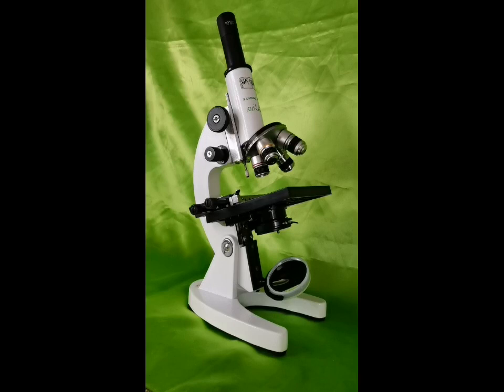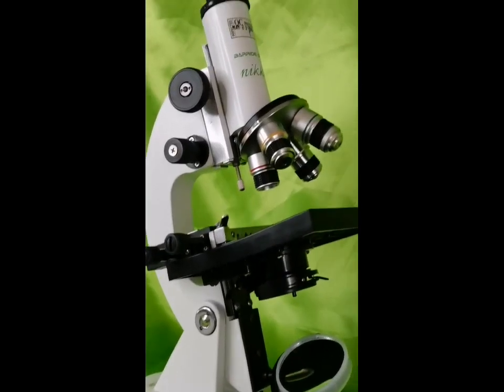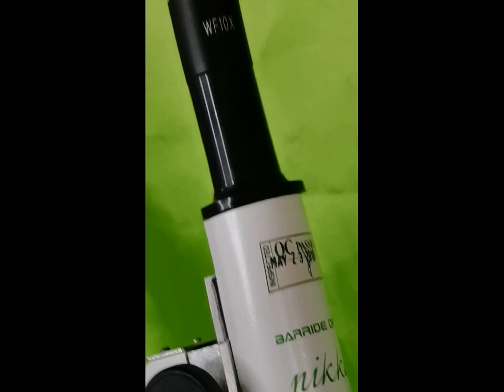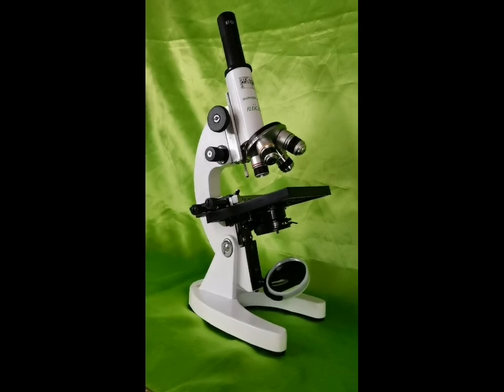The microscope is one of the oldest scientific tools which is still in common use today. It became an indispensable tool of scientific research in the 19th and the 20th century. The first microscope was invented by Zacharias Janssen in the 1590s, but it was Anton van Leeuwenhoek who got better results with a powerful single lens magnifier that he made by himself.